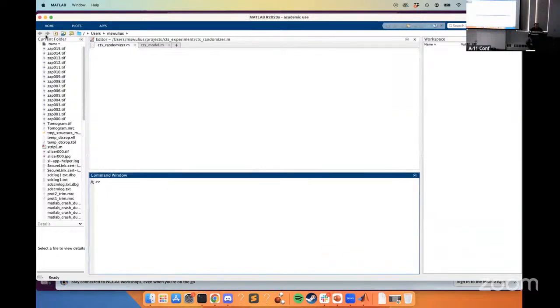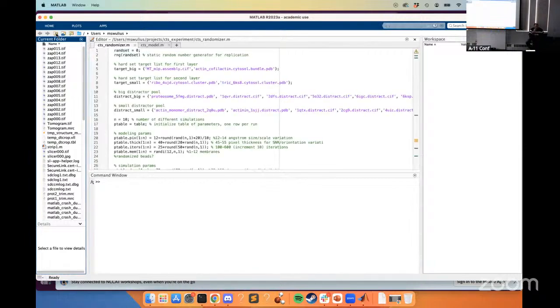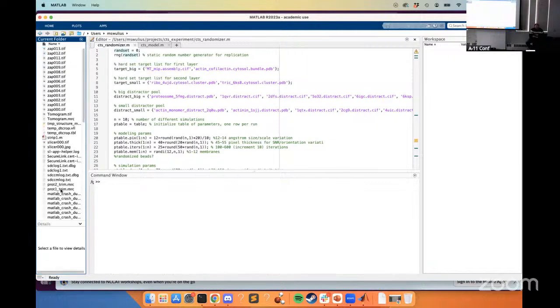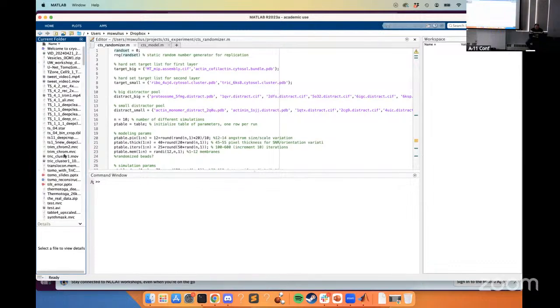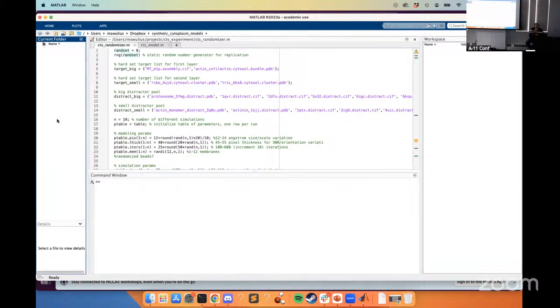All right, so. Let me just set up my environment a little bit. It's kind of crazy right now. Here we go. Okay.